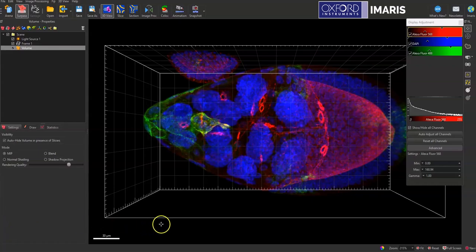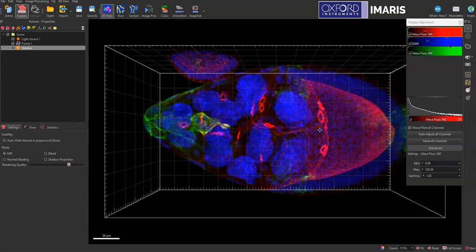Hi, today I'm going to show you how you can take a 3D image and turn it into a mock time lapse so you can measure the different statistics across the different planes.